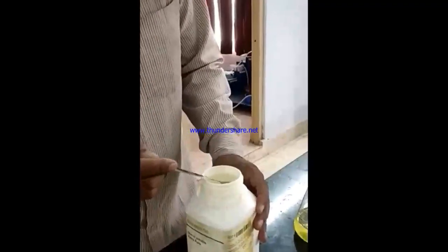Previously the volume method was being done. Now starch indicator is being added. It might turn bluish green. See, color will start changing. See, color is changing. Okay. It is bluish green in color. It should actually be blue in color, but since our sample did not properly mix, it has turned, suppose, bluish green in color.